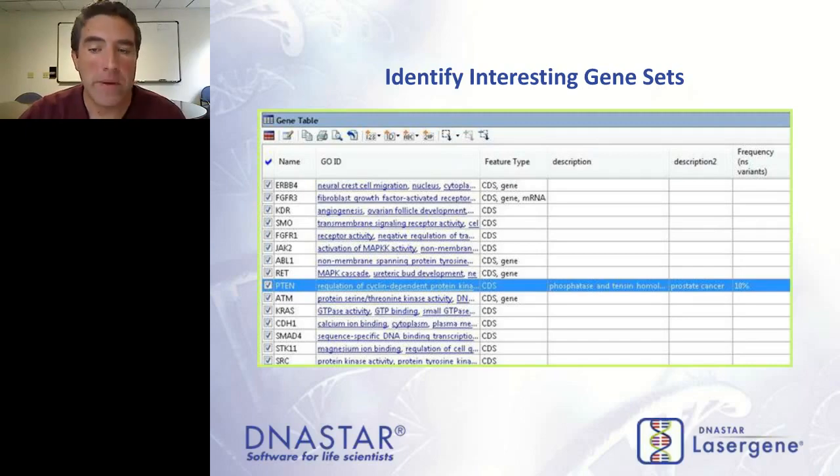And then these last columns on the left or right-hand side are just a custom file that I made, a set of genes that are known to be involved with prostate cancer. I loaded this file in with the custom import wizard, and I can see in my gene set search that one of the genes is also showing up in my gene list. It's a great way to compare your filtering results in ArrayStar with known genes of interest for your type of analyses. Another place I could go is things like ontology. I don't plan on showing that today, but that's a place we could go as well.